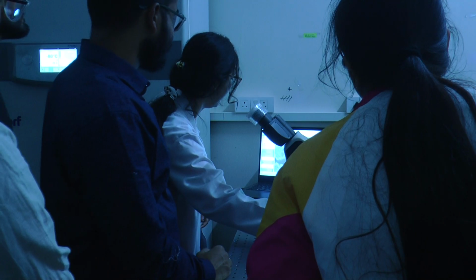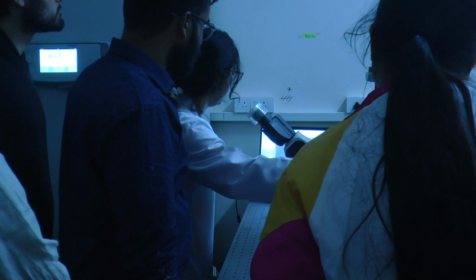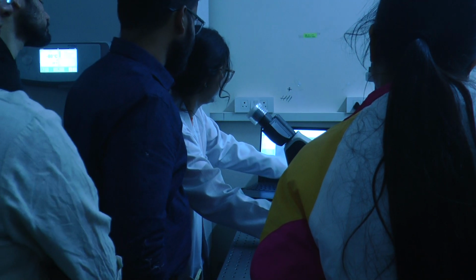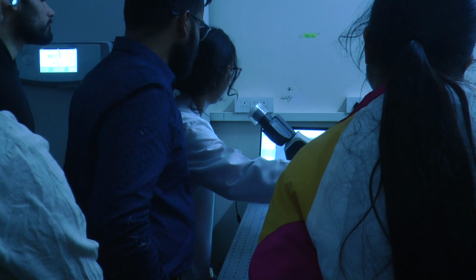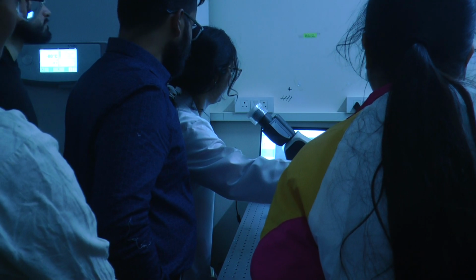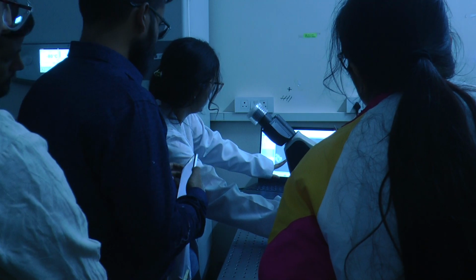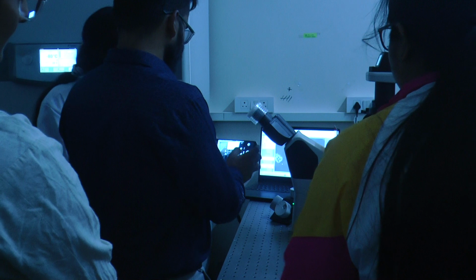We have commercial cells, they are also bulging out. So what do you want to use it for? All these are GPMVs. If you leave it a bit more, they'll come out.